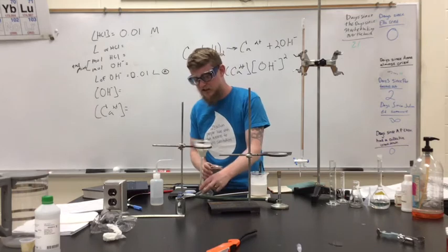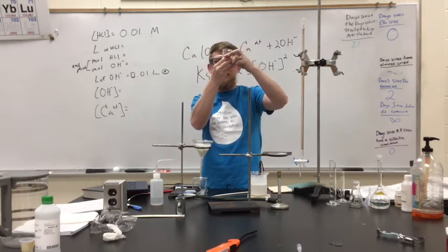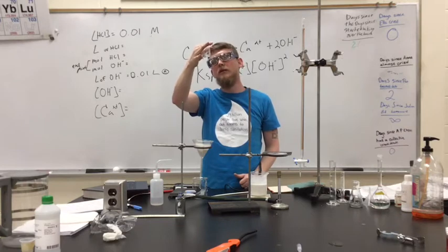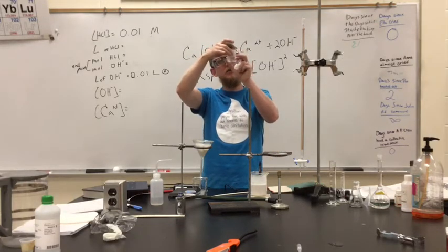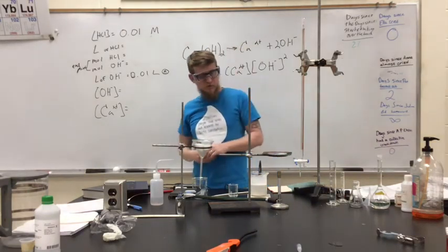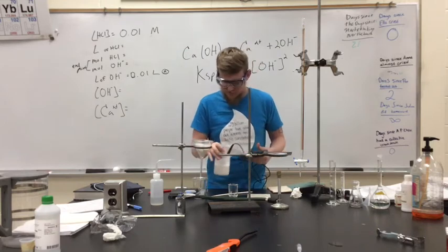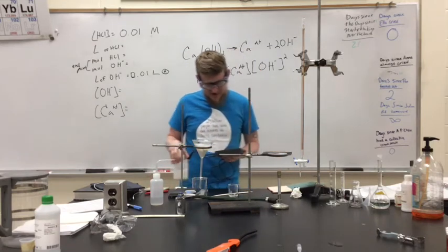We're going to put this beaker down here. All right, we've got our 10 milliliters right here. It's definitely not at 96.5 degrees anymore. It's a little cooler as it's gone through, right? But it is still warm, right? And hopefully, we didn't give it enough time to come to equilibrium. So we're going to just let this cool off and perform our experiment once it's cool. All right, I'm going to move this out of the way for us. We don't need this any longer. All right, this has been sitting here. It's now at 89.